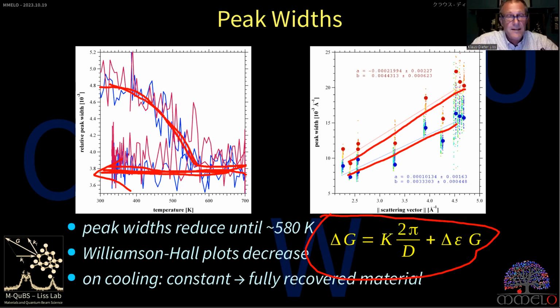But we can see that the strains recover. So internal stresses, strain gradients, they recover. And we see at the top here is 4 times 10 to minus 3, and here 3 times 10 to minus 3. So the difference is about 1 times 10 to minus 3. Meaning at the beginning we had strains in the order of 10 to minus 3.